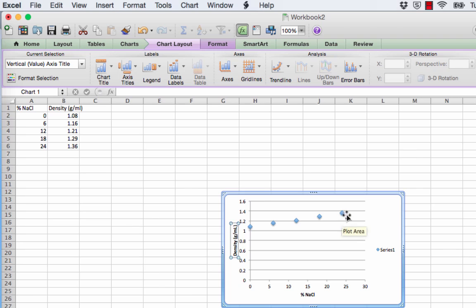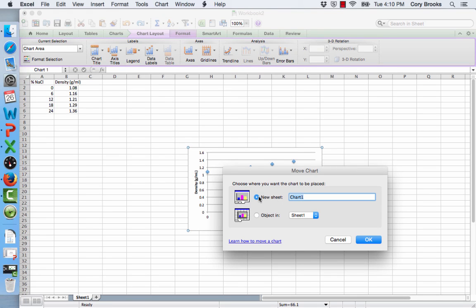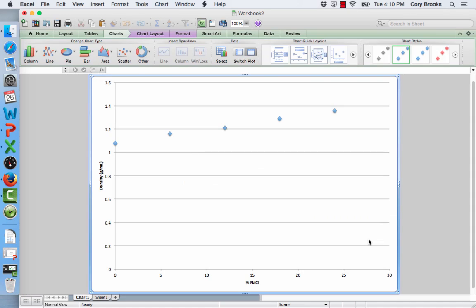Since I only have one set of data, I do not need to indicate which series this is, so I'll delete that to make more space. All right, our graph looks a little better, but just to make it easier for you to see, I'm going to move it into its own screen. And so to do that, if I had a mouse, I would use my right-click button, but since I'm a Mac user, I'm just going to use Control-click. And you see a variety of options here. If you click on Move Chart, you can put it in its own sheet. So New Sheet, Chart 1, OK. All right, now everything is nice and big and clear for you to see.